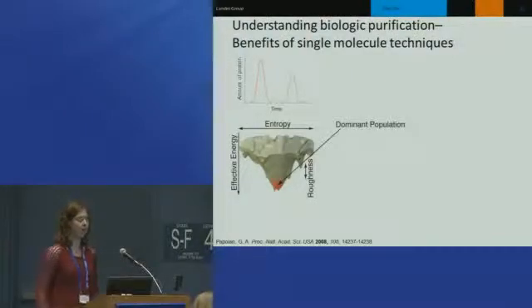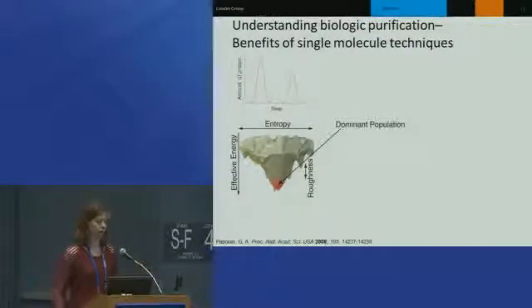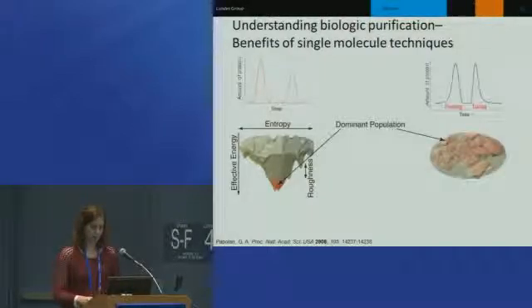And coming back to that graph that I showed on my first slide, what I mean is that our most basic interpretation of how chromatography works is that there's assumed to be a weak interaction that is multiplied over the course of the column, and that weak interaction could be described as a single Gaussian, and that leads to a perfect elution curve. But of course, as Mary said, that's never the case, especially with proteins.